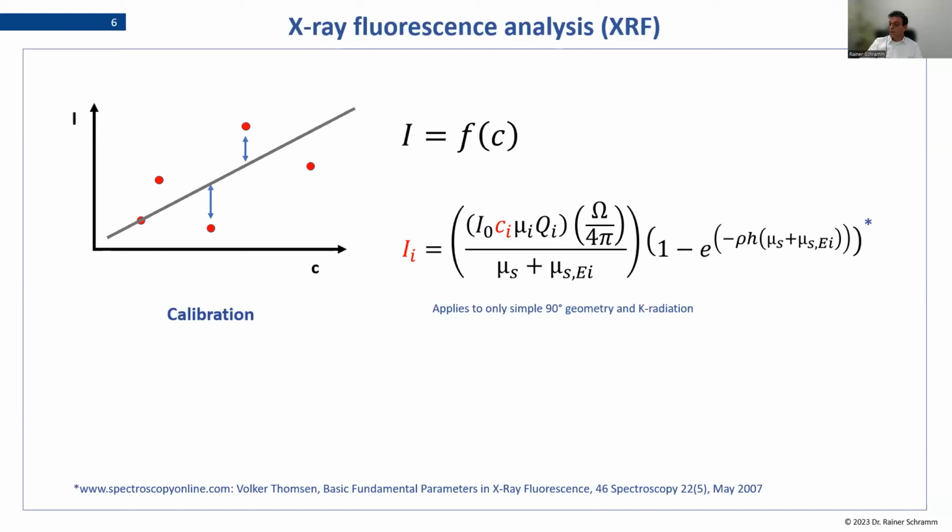Another question here, is there a special way to evaluate a mixture of oxides and sulfide? Yeah, this is a very good question. I think your question is in the way that when you analyze something and you define the rest is oxidic or the rest is sulfidic. This is something which is very difficult to distinguish. I would say that the standardless software cannot distinguish whether your element is linked to oxygen, to an oxide, or whether your element is linked to a sulfide.